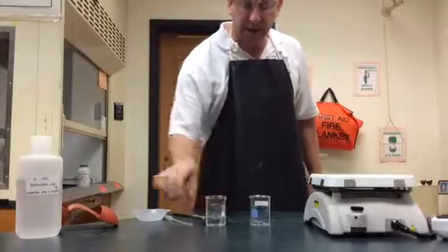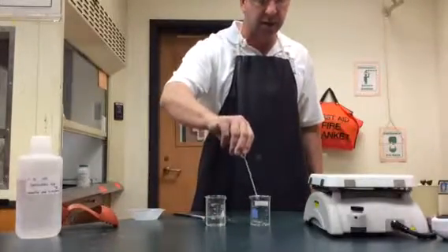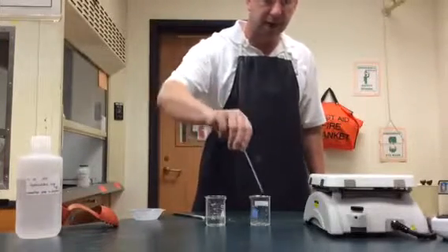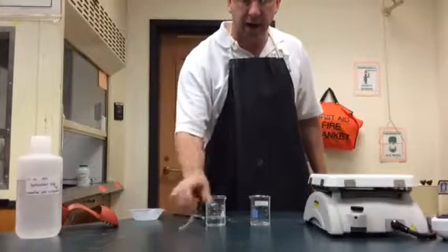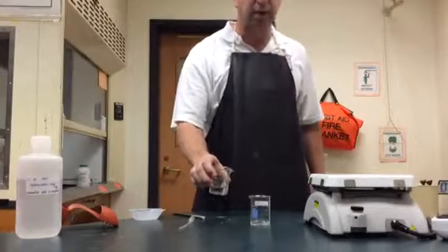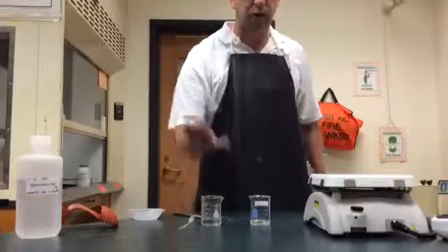We'll go ahead and add some hydrochloric acid. The lab might call for you to use a pipette to add a little bit of acid onto the magnesium at a time. If things are moving okay and not too fast, I will go ahead and pour some of my acid onto the magnesium, as long as it's not going too crazy.